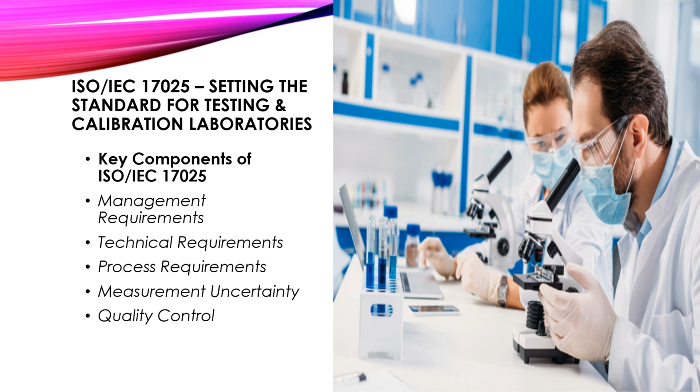Process requirements. Laboratories must follow standardized processes for sample handling, testing, calibration, and reporting. This includes ensuring the validity of test methods, the accuracy of measurements, and the traceability of calibration standards to internationally recognized references. Measurement uncertainty. ISO/IEC 17025 emphasizes the need for laboratories to assess and report the uncertainty associated with their measurements. Understanding and quantifying uncertainty enables clients to make informed decisions based on the reliability of test results.